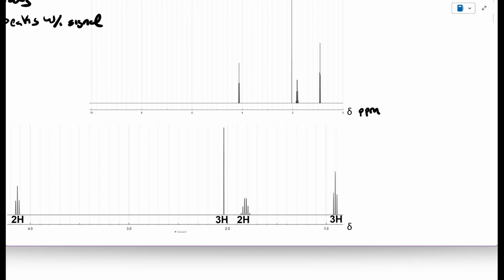That seems like a problem, because that would mean that the x-axis would be different for every NMR. You would have to know what kind of instrument you were using in order to read the x-axis. So we decided to correct for the magnet strength. We take the amount of energy needed to flip the spin and divide by the magnet strength, and that gives us a standard x-axis, so that a hydrogen will have the same x-axis value on every NMR.